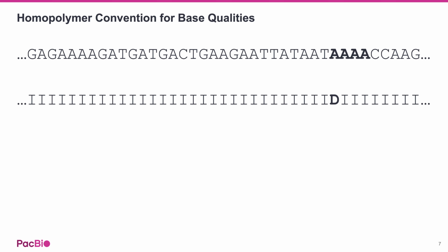One can expect that the true homopolymer length will vary from the calculated homopolymer length according to a normal distribution centered on the calculated length and with a variance in accordance with the base quality value on that leftmost base. Especially astute investigators may occasionally notice a non-maximal quality score in a homopolymer run. Such cases are where there was some, usually small, uncertainty in the identity of a base in what was ultimately calculated to be a homopolymer run, but such instances are uncommon.